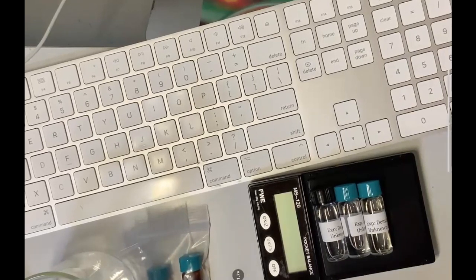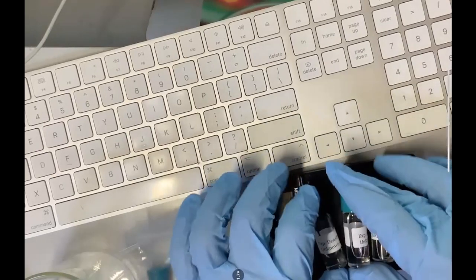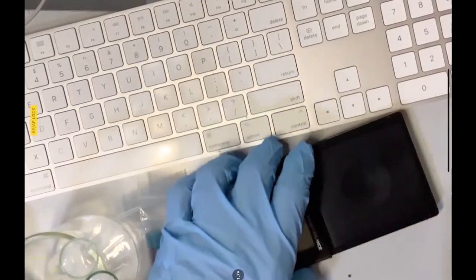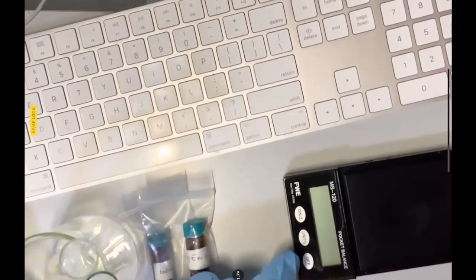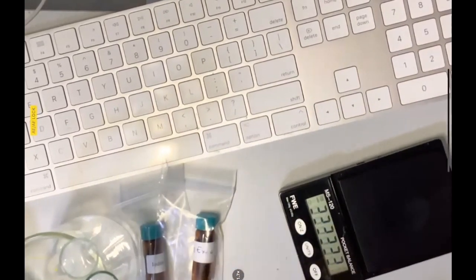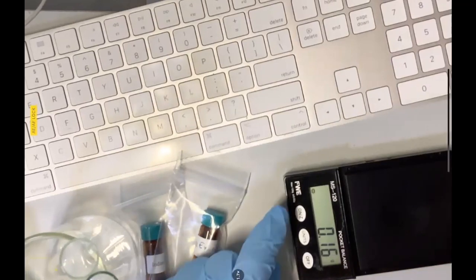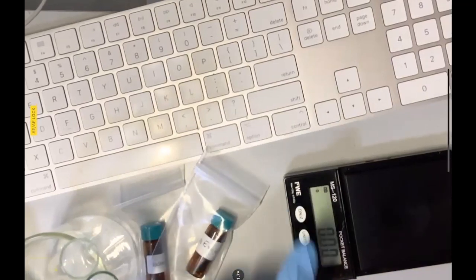So I'm going to put on my safety goggles. In this experiment, you're going to put these onto the side, take your scale and turn it on. Make sure it's reading grams, and that you tare it. You tare it, so it reads 0.